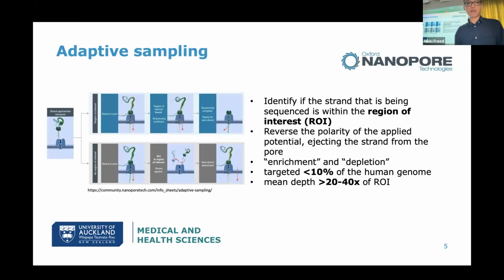But then Nanopore comes to rescue. Warren already did a brilliant introduction to adaptive sampling, which is the technique that we have been using to resolve some of those complex structural variants that we are seeing. So computationally targeting a region of interest just sounds amazing.